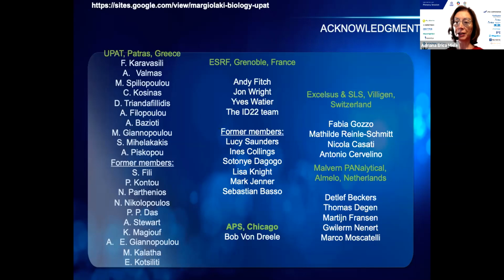After you have screened all the polymorphs, did you try seeding to grow one single crystal? Yes, and in fact, in certain cases, it worked, and that's how we grew the single crystals to obtain the single crystal data I showed. In certain cases, it works, it speeds up crystallization, and it produces better crystals.